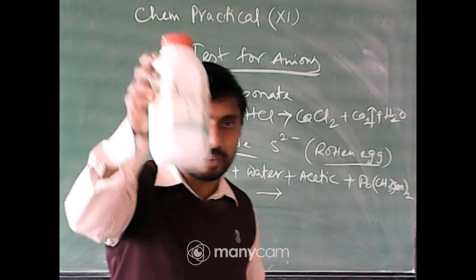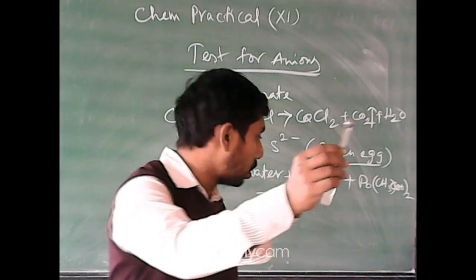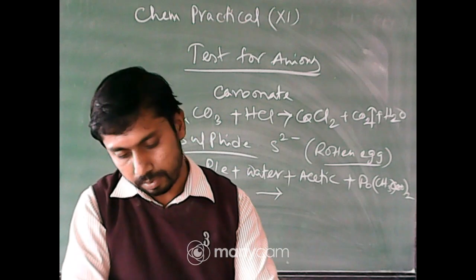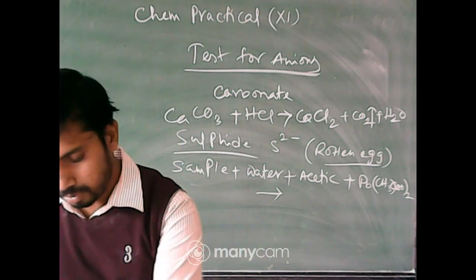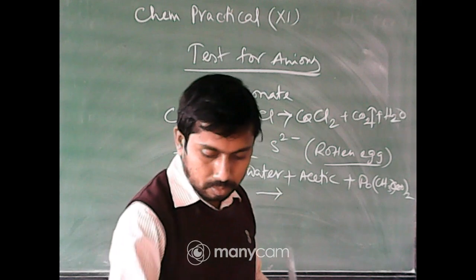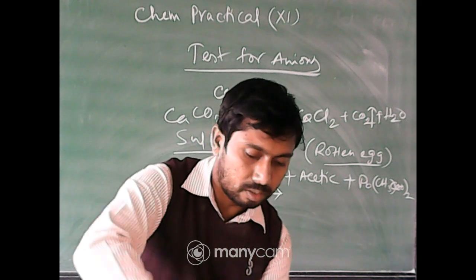So this is the sulphide sample taken here. This is called a spatula. Very little amount of sample taken.